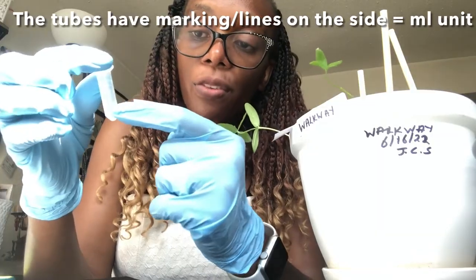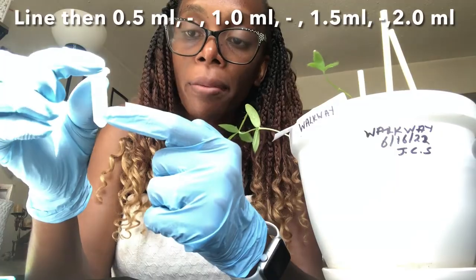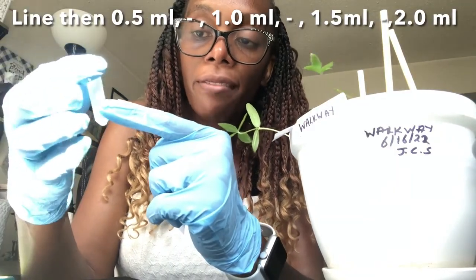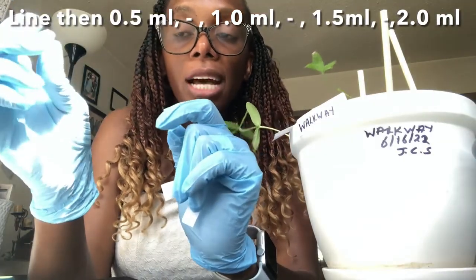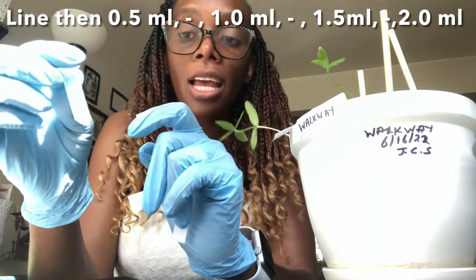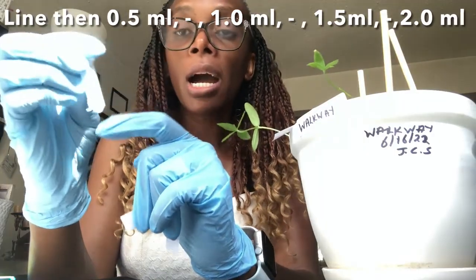So you have the first unit mark at the bottom, then the second one has a number, that's 0.5, and then the next one has no number, then 1.0, 1.5, 2. Those are the units for mils, or milliliters. And so I will refer to these when it comes to how much you add.